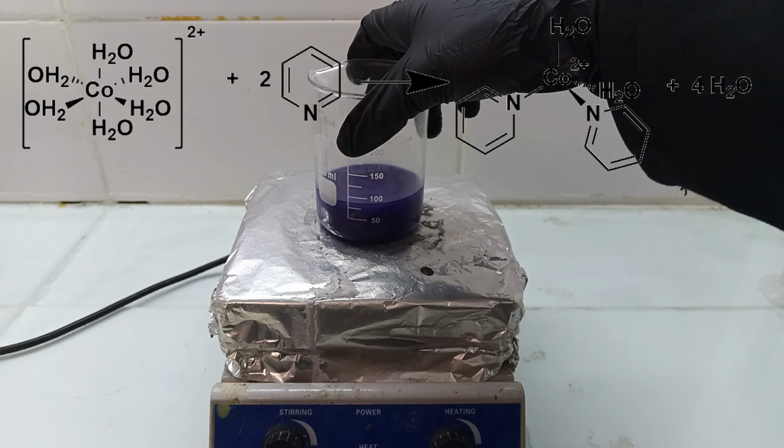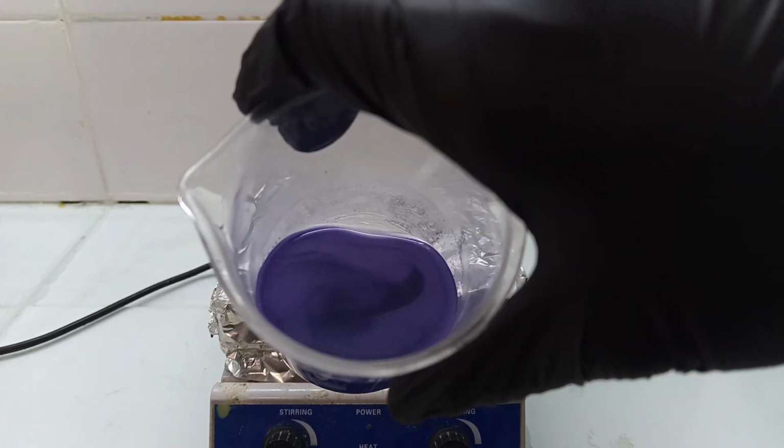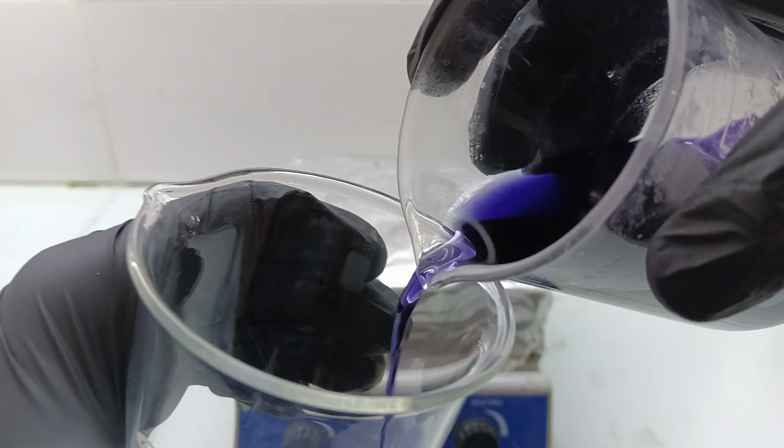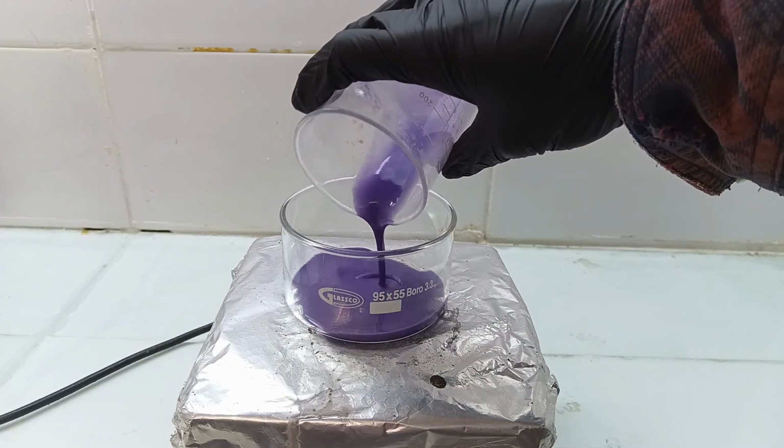Coming back the next day, the first complex precipitated out as a very fine, light purple powder. I decanted it, transferred it to a crystallizing dish, and slowly dried it on the hot plate.